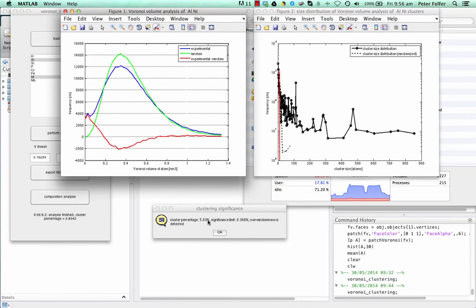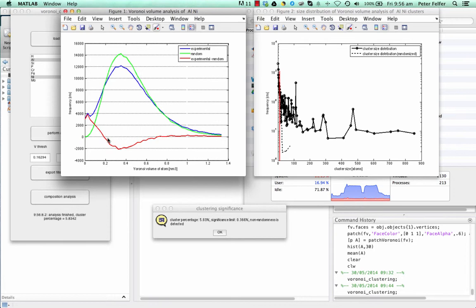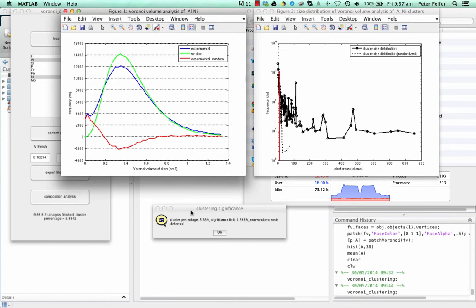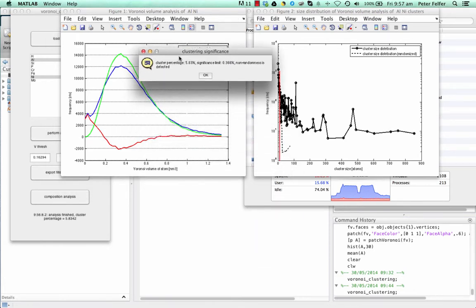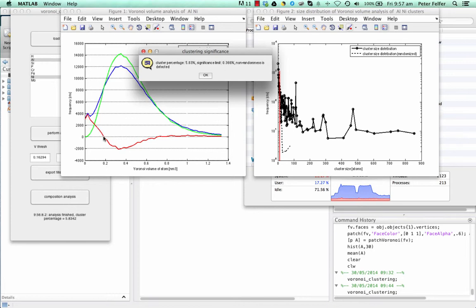What do these numbers mean? The 5.83 is the integral of the experimental minus random curve up to the point where it hits 0. This curve is an approximation of the distribution of the clustered atoms. Therefore, we integrate the amount of clustered atoms up to the point up here. And this is also the relevant figure for the Kolmogorov-Smirnov test for randomness. This is the significance limit. The Kolmogorov-Smirnov test tells us if this integral here is more than 0.366% of all atoms, then the clustering is non-random. And that is actually the case.